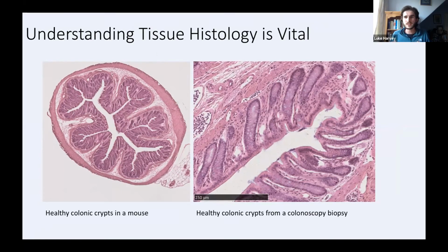So the LCM probably isn't the best tool for having an idea of what's happening in the entire gut. We have to restrict ourselves to little regions of it, and we can randomly sample. But once we have an idea of what mutations are good and what mutations are bad, we can take samples from stool, and we can see, are there any of these mutated genes in that sample? Because that's gone down the entire gut.